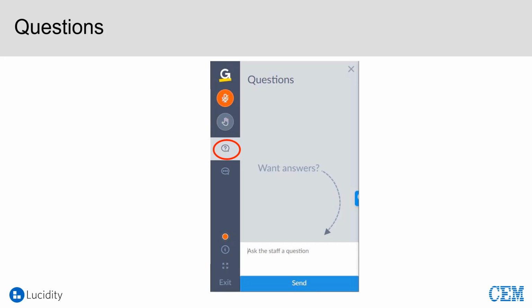Right. And it looks like we have our very last question. If someone wanted to make just one step towards greening their chromatography, what would you recommend? That's a great question. If I wanted to look at one thing, I would go back to what I suggested a few moments ago and try optimizing for speed, and think about how you can reduce the time that you're looking at baseline instead of looking at peaks.